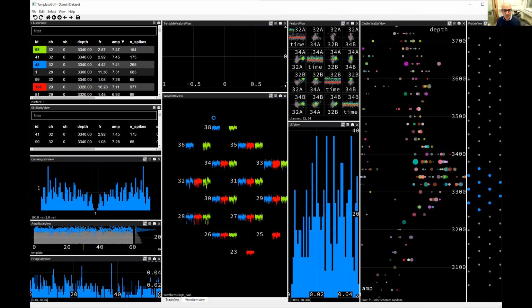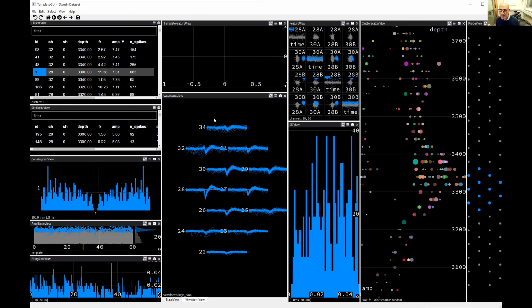Nick, there's a question about what data set you're looking at now. Is it the one? This is the mini data set. It's the one we provided for the course. Yep. So you should be able to find neuron ID number 1 that looks like this, I hope.